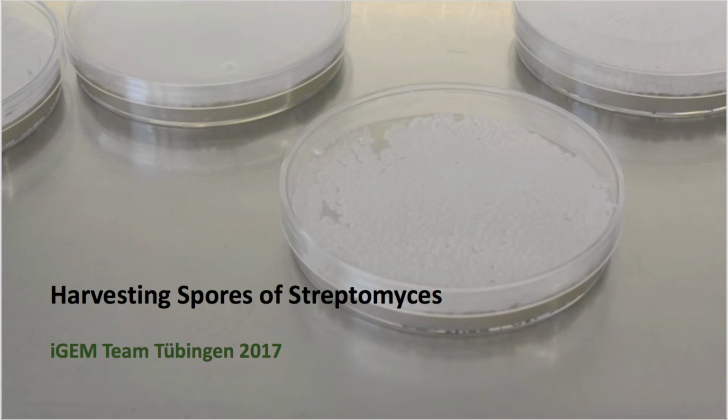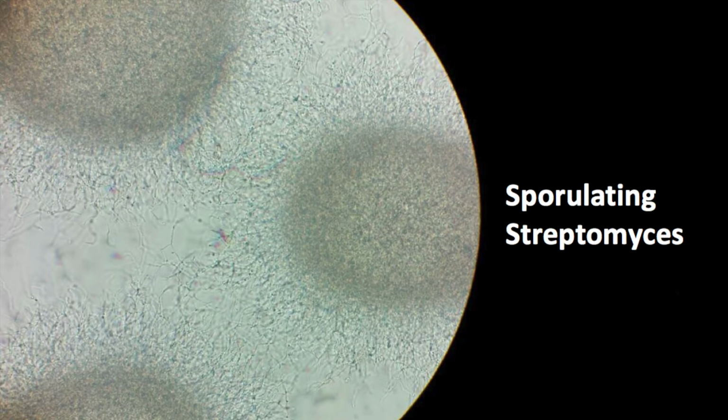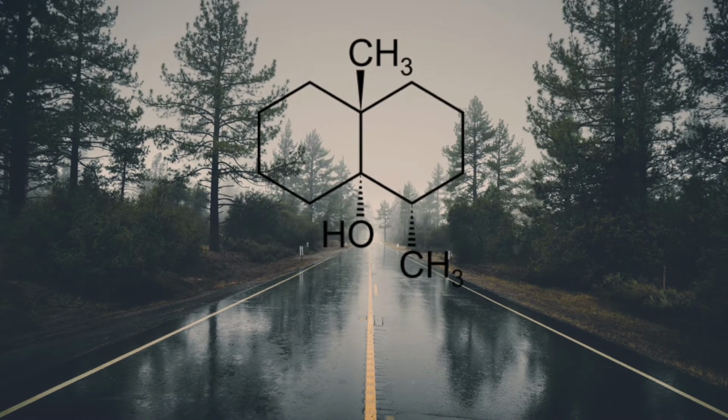In this video, the iGEM team Tübingen wants to show you how to harvest spores from Streptomyces colonies. Streptomyces are really interesting bacteria. They are gram-positive, have a high GC content, and are mainly found in soil and decaying vegetation. In contrast to most other bacteria, they grow in a mycelial manner and produce spores. Furthermore, they produce the volatile metabolite geosmin, which is the earthy smell after a rainy day in the forest.